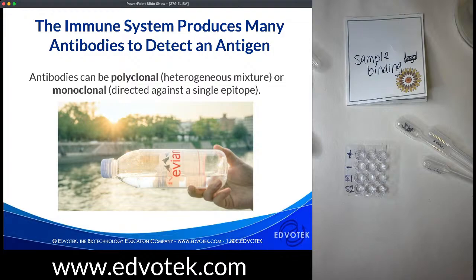Both types can be used in a wide array of experiments, from the ELISA to staining cells or doing a Western blot. The most important thing, when developing an assay, is to take the time and the care to select the best antibody for your application. To be used in the laboratory, antibodies must have specific, robust, and reproducible interaction with their antigen. Antibodies that have a high affinity for nonspecific antigens will have unwanted cross-reactions that can result in high background. In contrast, an antibody with a weak affinity may not be sensitive enough for antigen detection. And so these antibodies would produce results with a high false positive or high false negative rate.